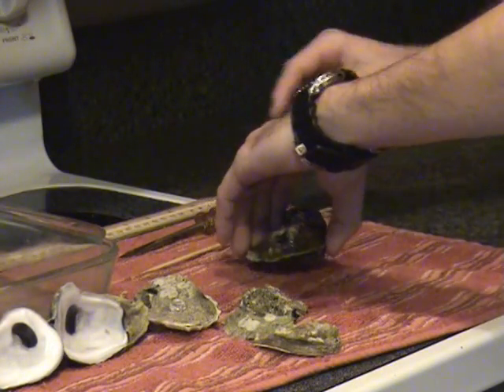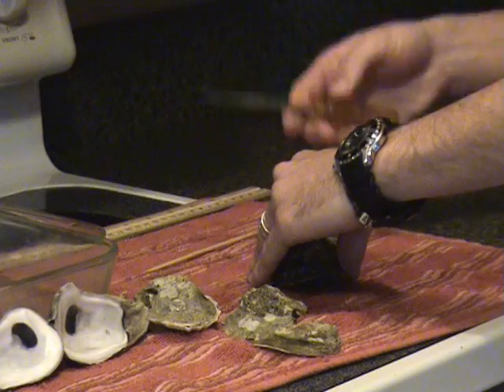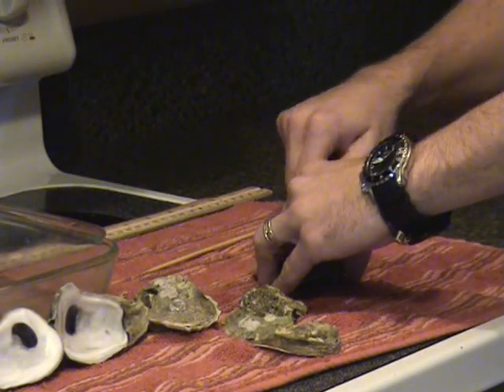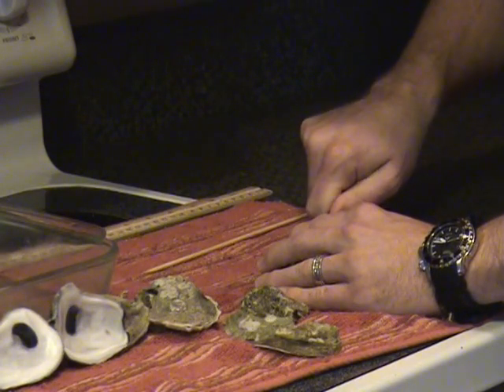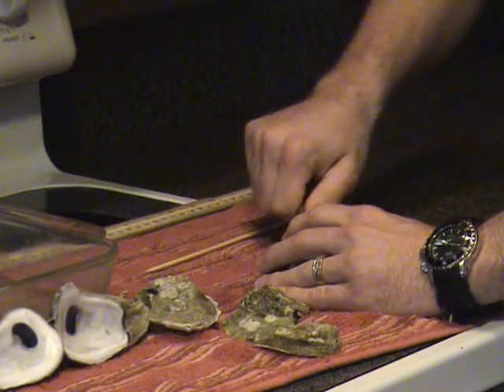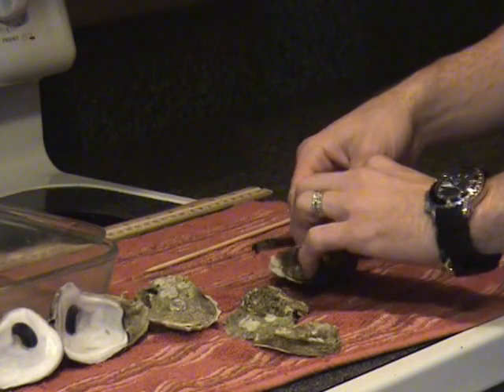Firmly hold down the oyster with a gloved hand. Insert the oyster knife in the hinge of the oyster. Rotate the knife around until the pressure pops the hinge. Move the knife around the upper edge of the right valve until the adductor muscle is felt, then sever it. Place the right valve off to the left side.